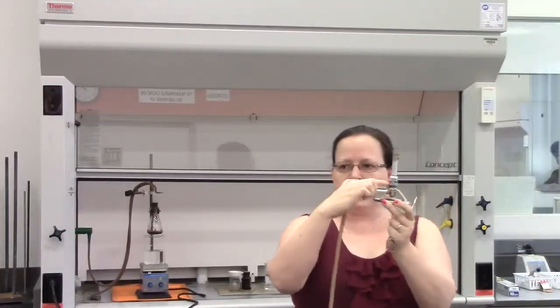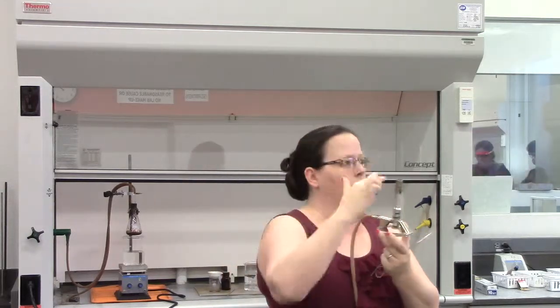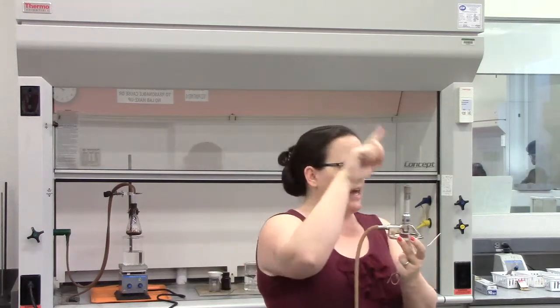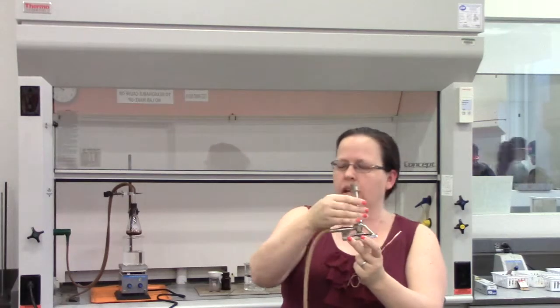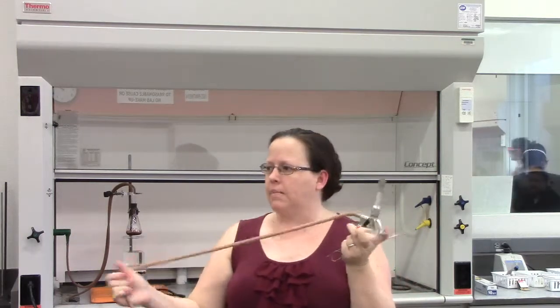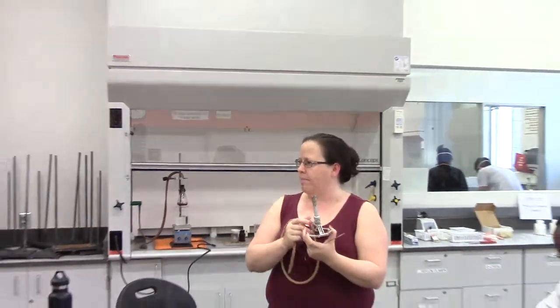The more oxygen you get in, the better the combustion is, and it'll change the color of your flame. If it's clamped way down and you don't have enough oxygen in here, your flame's going to be yellow or orange. As you open up and add more oxygen, the flame's going to turn blue. And that's what we want, that nice blue flame. So when it's time for you to set this up, same as if you were ready to do the copper, I'll come over, I'll show you how to properly light it, how to set it up, how to adjust your flame. Okay?